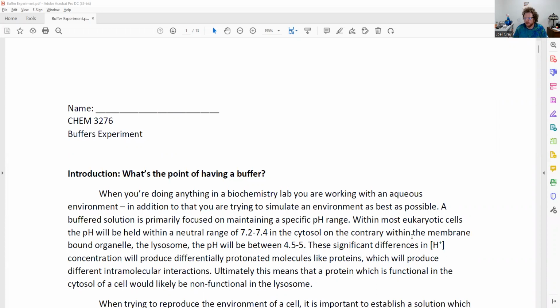And that thing that you did in Chem 2 was preparing buffers. Generally, when you prepared a buffer, you probably were given a target pH, and then asked to basically use a weak acid and a strong base and prepare a buffer at that specified pH. Well, that's not so radically different at all from what we do in biochemistry. What probably makes this a little bit different, however, is the substances that we're using to prepare that buffer.